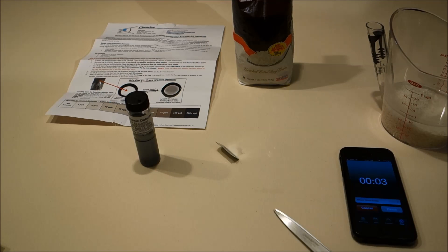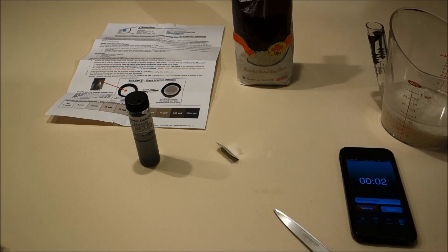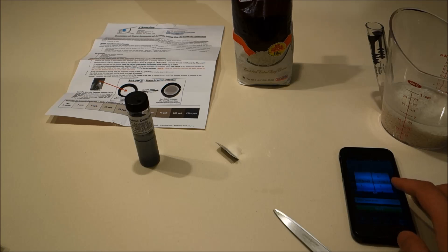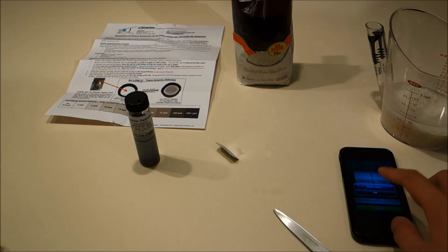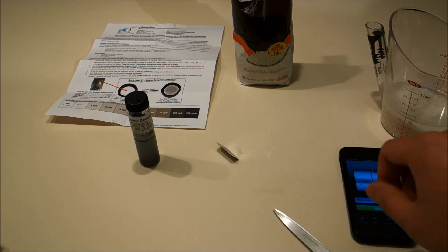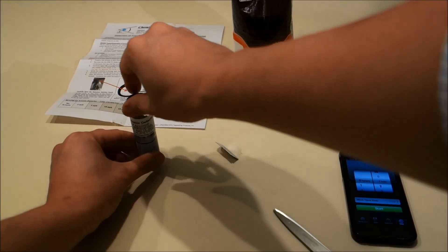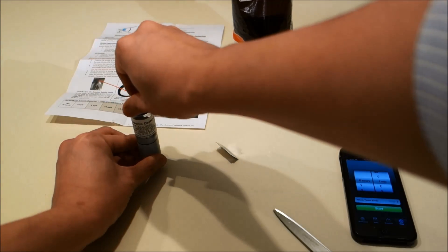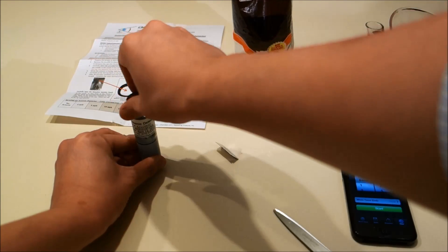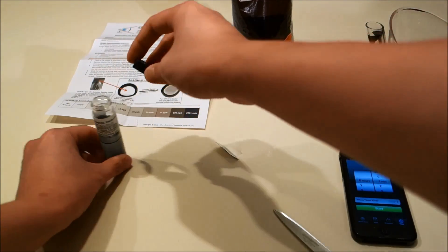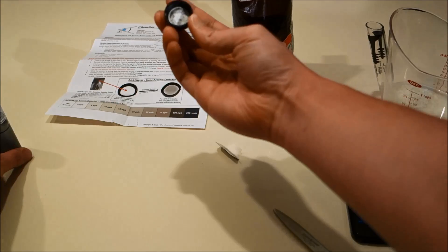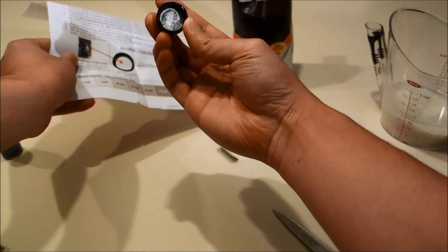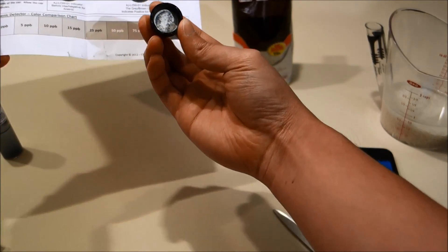Okay, now the 30 minutes have passed. We are going to carefully unscrew the cap from the vial and compare the color to the included chart.